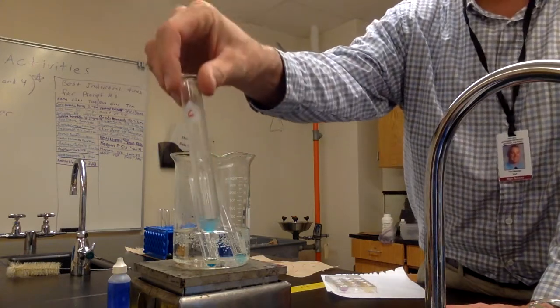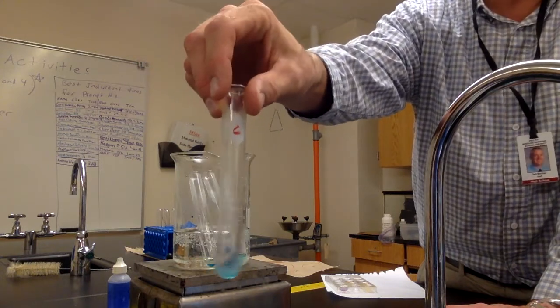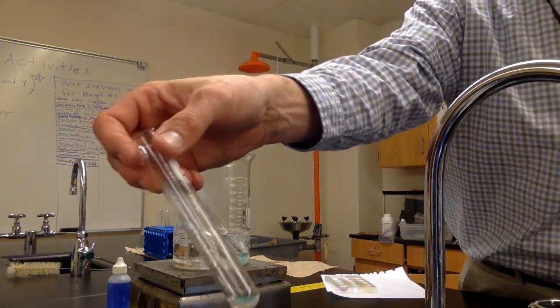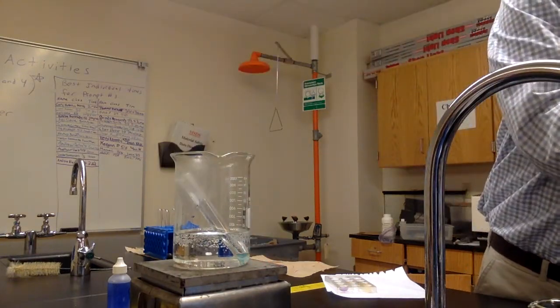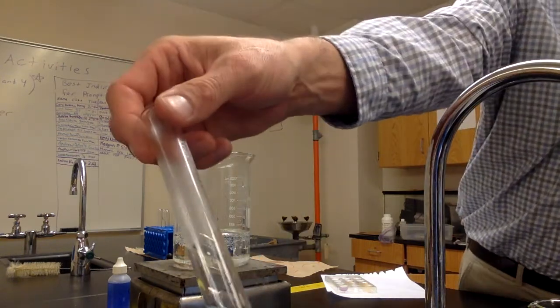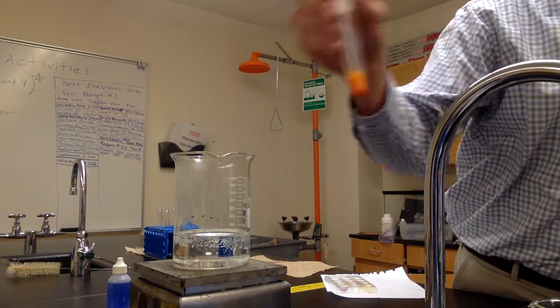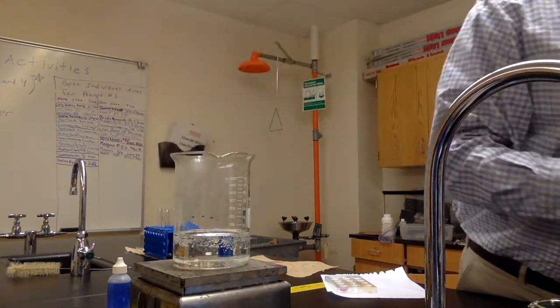We can see that after 10 minutes, C is not changed. Therefore, C is still blue, and it is negative for sugars. D also has not changed. D is still negative for sugars. And the water, as we expected, the water did not change, so the water is negative for sugars. Okay. So this is just an example of what the orange color would look like.